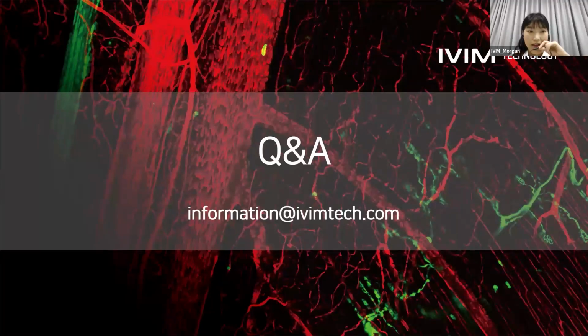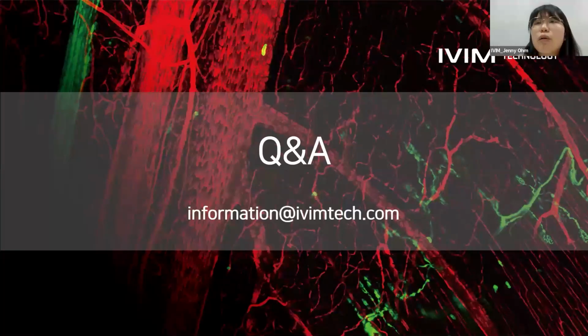And it may be the last question. How are the in vivo labeling kits injected into the mice generally? Generally, our in vivo labeling kits are injected intravenously. We mainly use the tail vein intravenous injection, but we also utilize retro-orbital injection.